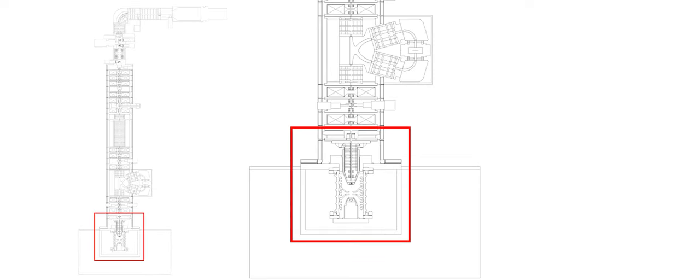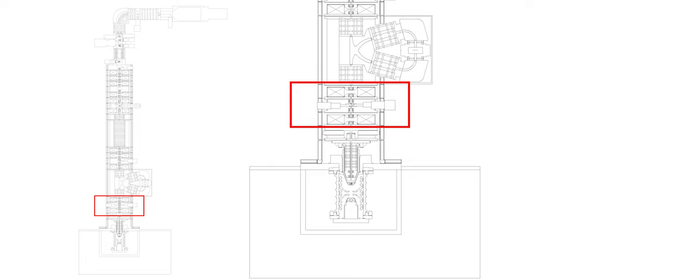Okay, here is a diagram. You will see this poster in the Nion microscope room. I want to briefly introduce this to you, because you have seen the software side interface. Also, you need to have a sense of understanding of the mechanical design of the microscope. Let's go from below. From the lower side is the Nion microscope cold field emission gun. And then this is some gun lens part. It is part of the gun.